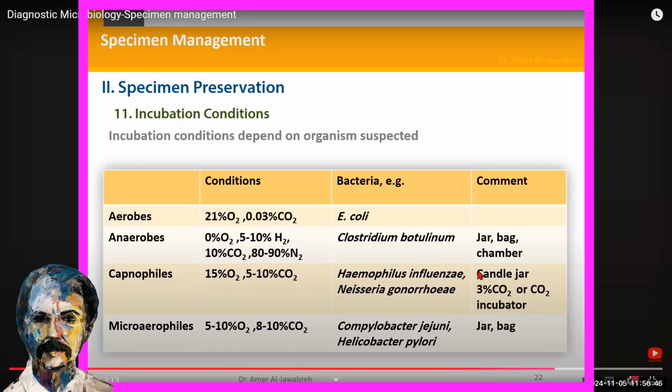By candle jar. You know the candle jar? You put your plates in the jar, put a candle, light it, and close. After less than a minute, the candle will die out and go off. And the candle will release some CO2, which the bacteria will use.